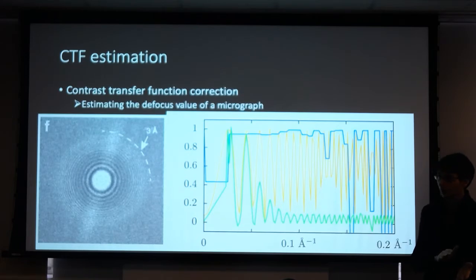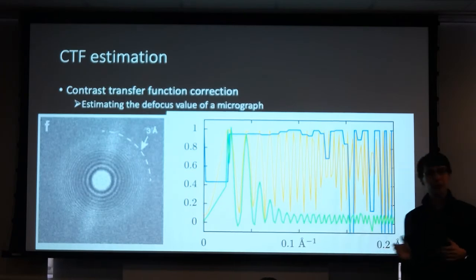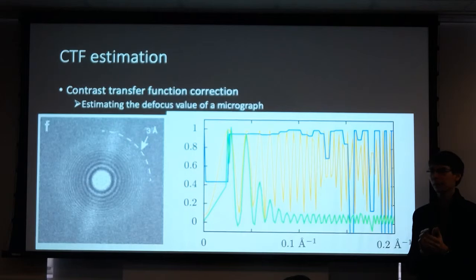Now there's a problem with that. You get less contrast. So you might want to do that, but you want to be careful. There's a trade-off to have here. But it's also a trade-off to think about in terms of, if you have a very small protein which has very few features, how you align that protein is very important to your end result.